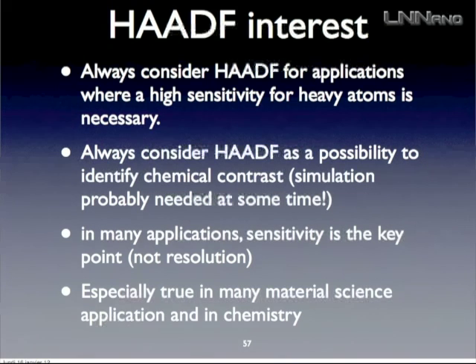If you really need sensitivity to a small amount of heavy atoms, there is no doubt that you may want to consider HADF. If you are not so interested in the resolution, just like the first experiment by Crewe, where you saw these uranium atoms, of course the size of these atoms as imaged were much larger than 1 angstrom. But the point is that they were able to detect 1 atom. As I said, it's especially true in many aspects of material science and chemistry.